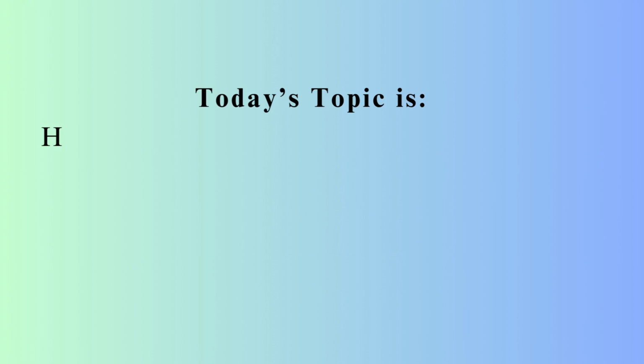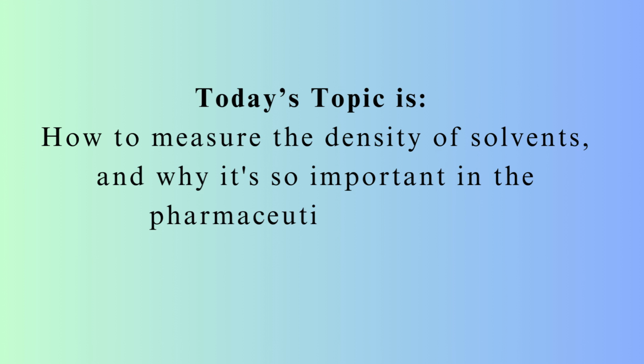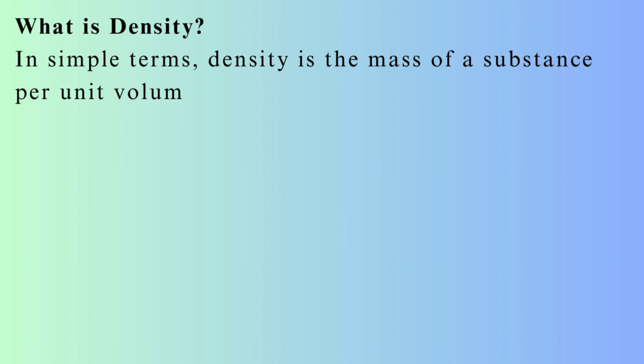Today's topic is how to measure the density of solvents and why it's so important in the pharmaceutical industry. Let's get started. What is density? In simple terms, density is the mass of a substance per unit volume.